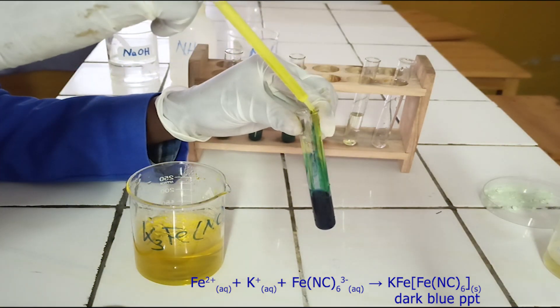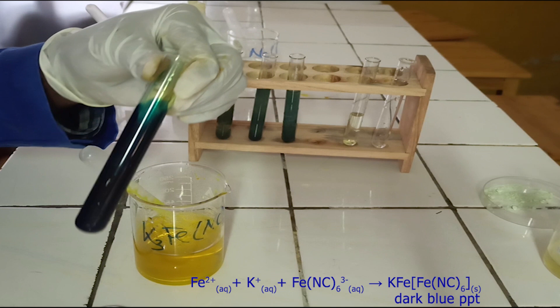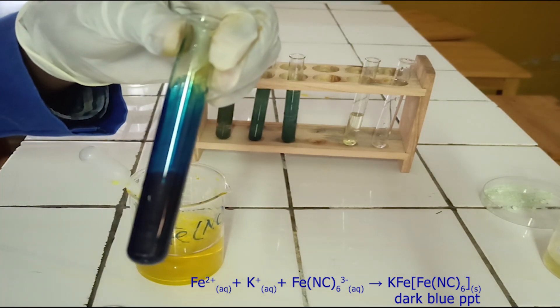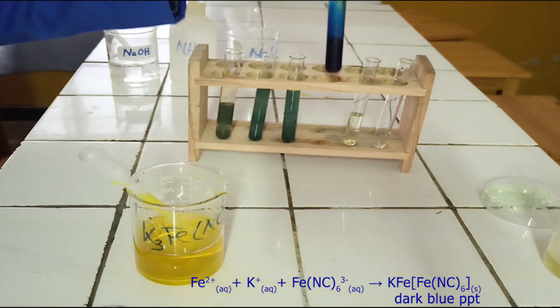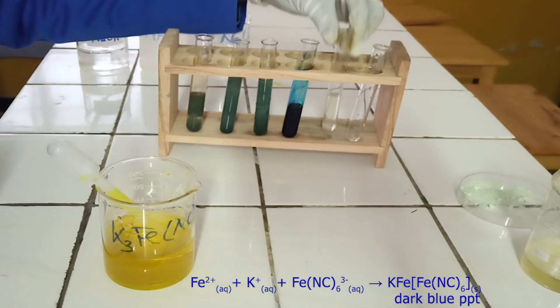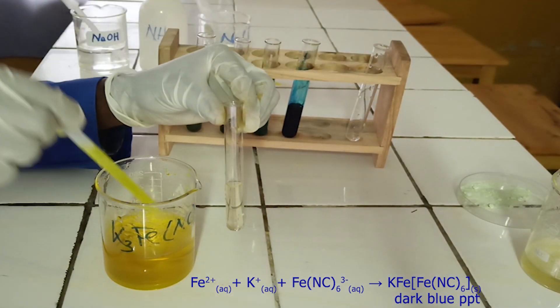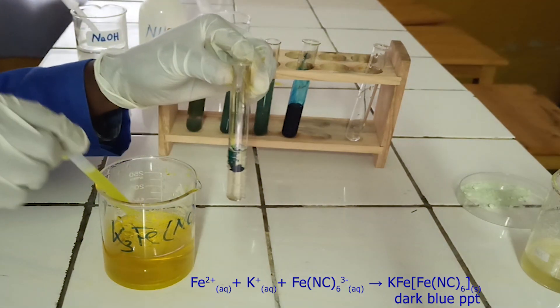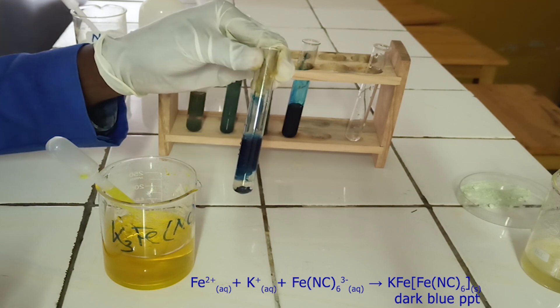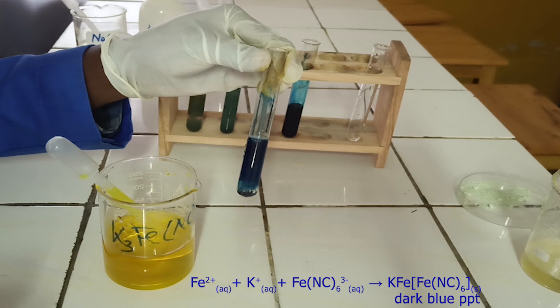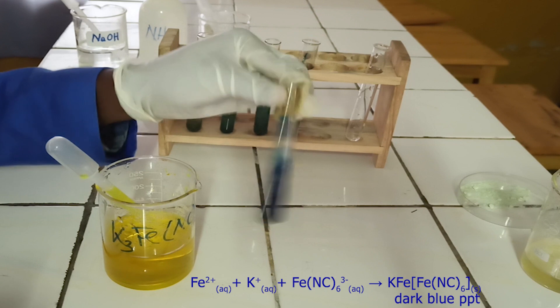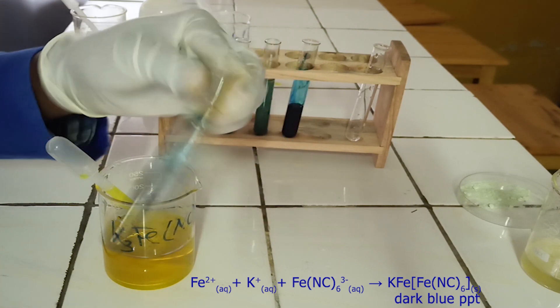Below, there is the ionic equation for this reaction. I repeat the confirmatory test — look carefully at what is going on. As you see, potassium hexacyanoferrate(III) reacts with iron(II) ion to form a dark blue precipitate.